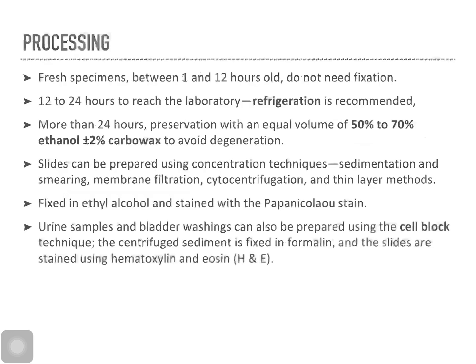Now coming to processing. Fresh specimens between 1 and 12 hours old do not need any fixation. If the specimen requires 12 to 24 hours to reach the laboratory, then refrigeration is recommended. If it requires more than 24 hours, preservation of the urine sample can be done by adding an equal volume of 50 to 70% ethanol with 2% Carbowax to avoid degeneration of the cells.